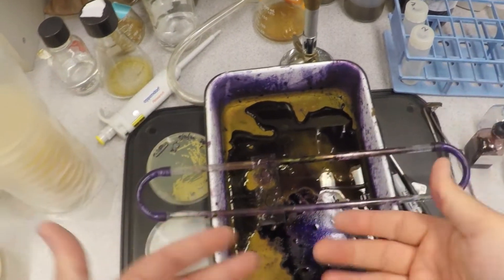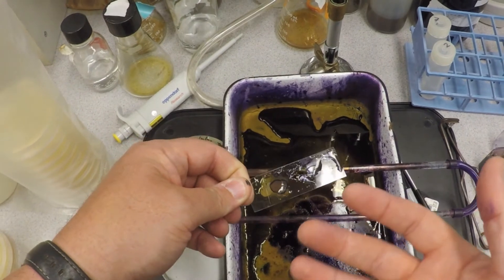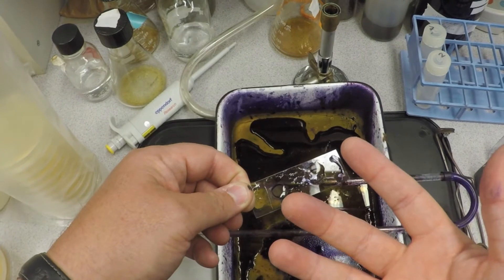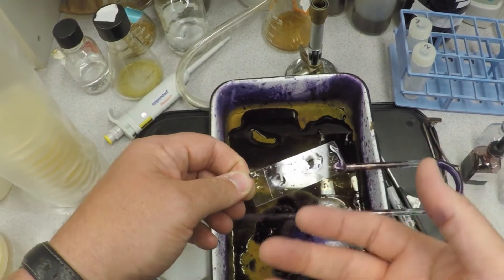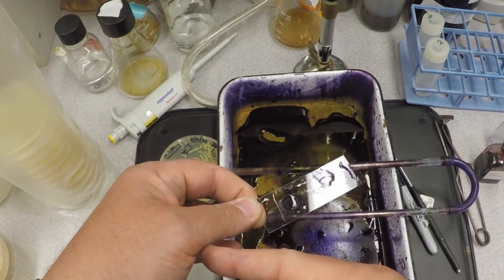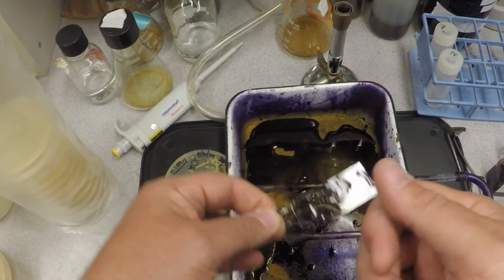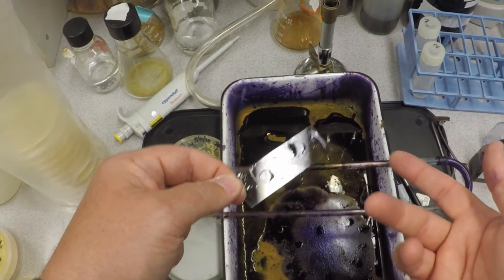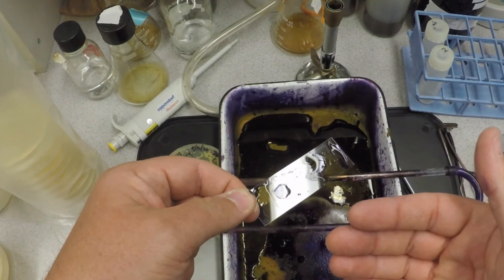So now if you looked at these cells, gram-positive cells would still maintain their crystal violet — they should look purple under the microscope. Gram-negative cells, on the other hand — you washed everything out, so what do you think they'd look like? The gram-negatives would be clear, because you washed all the crystal violet out of them, while the gram-positives maintain theirs and appear purple.